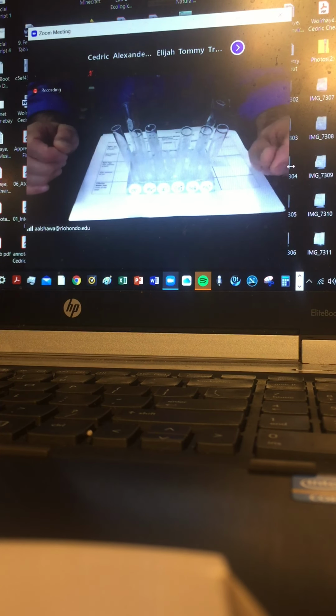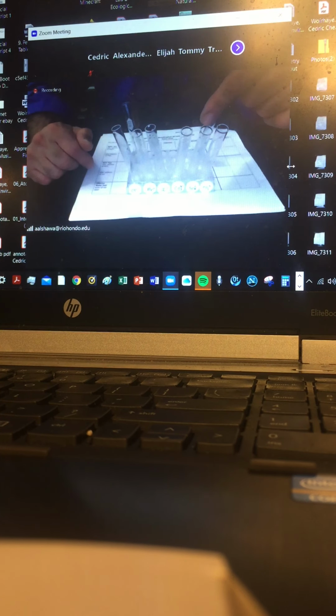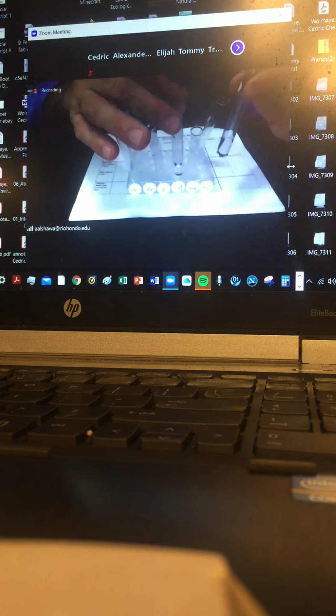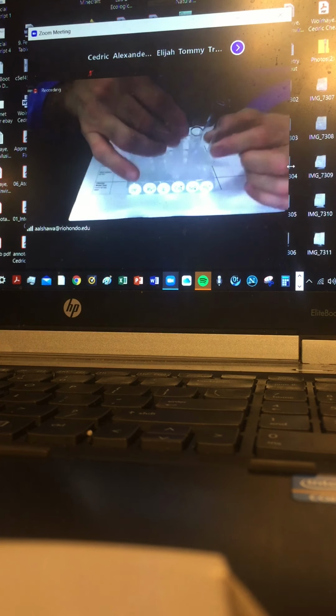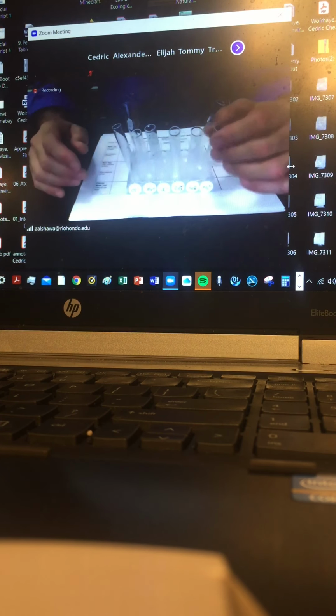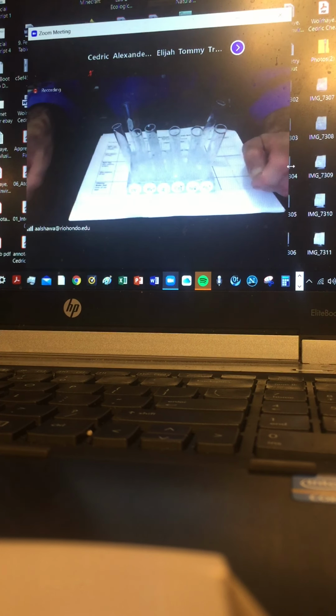Sulfate is a positive outcome of the barium chloride test. The barium chloride test is positive only upon the addition of the acid. So they all produce some solid at some point by the addition of barium chloride, but then the middle one remains positive. The other two are gone and negative. So I guess you can detail exactly the carbonate and the phosphate before and after, as far as the particles and texture, which one has more cloud, which one has less cloud, and so on.